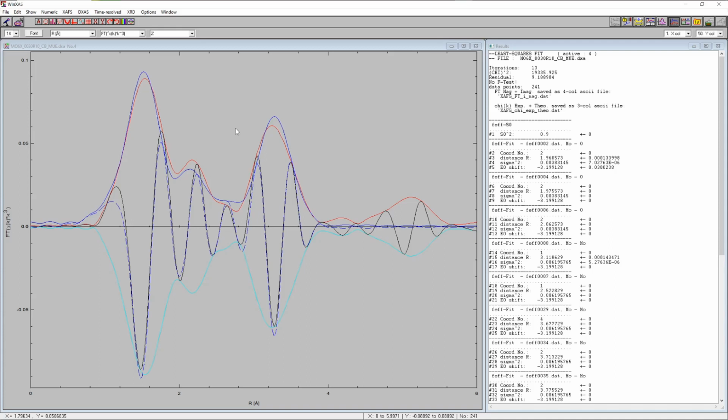And we can use those ratios, similar to what we did in the previous tutorial, to refine a mixture or a combination of the two theoretical structures for molybdenum dioxide and molybdenum trioxide to those spectra of the series. And this is what we are going to do for one spectrum now, and then we are going to try to apply this in an automated analysis.